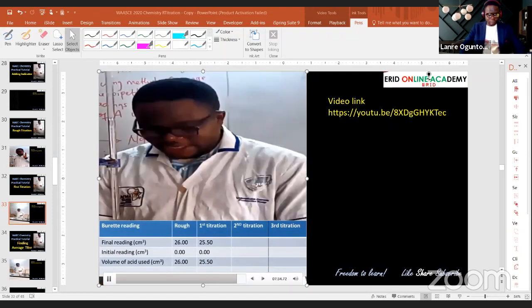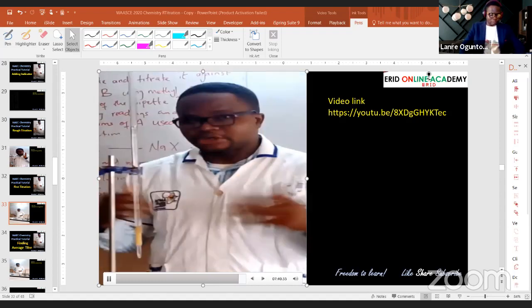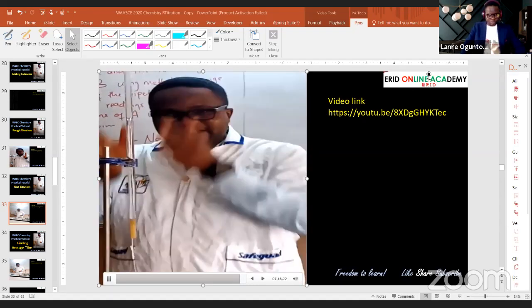Usually for your exam, your difference should not be more than 0.1, 0.2. But the rough was 26. The first titer is 25.5.